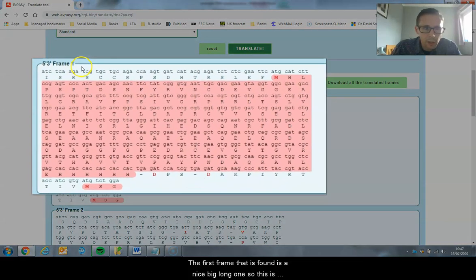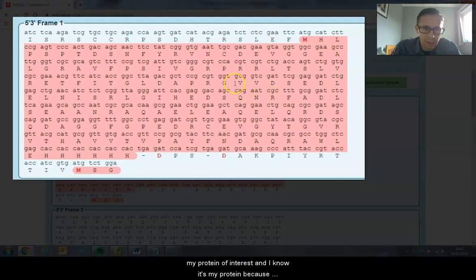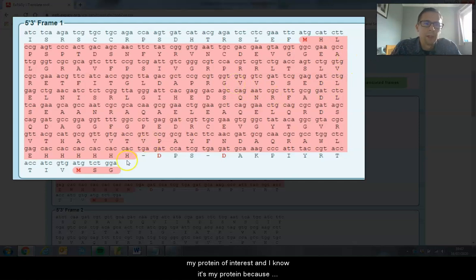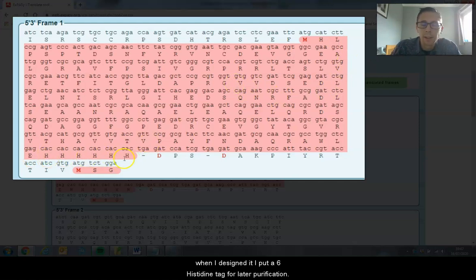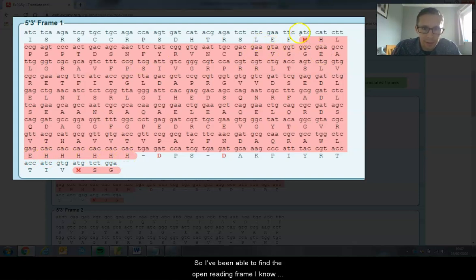The first frame it's found is a nice big long one. This is my protein of interest, and I know it because when I designed it I put a six histidine tag for later purification. I've been able to find the open reading frame.